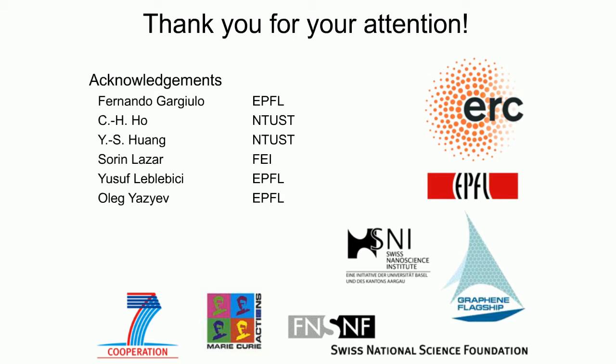But if you look at those, you notice that you get mismatch of the 2D material with the substrate. I can almost guarantee you that if you did a surface potential map of those materials, there would be a difference in the potential from the center to the outside, and it would correlate to the strain relief that they were hinting at. So the secondary effects, yes.